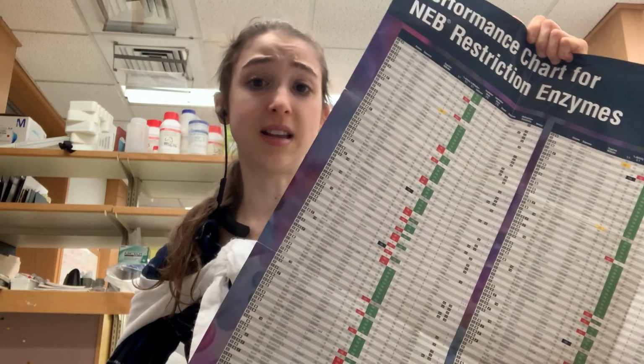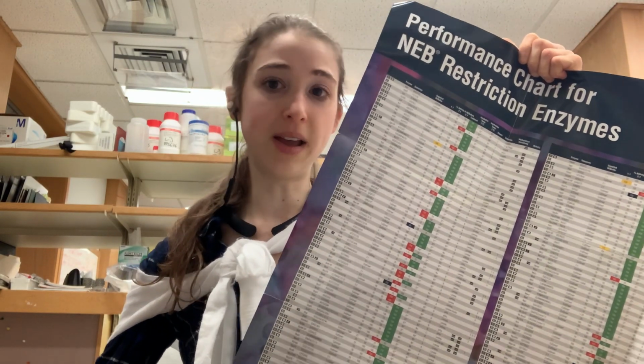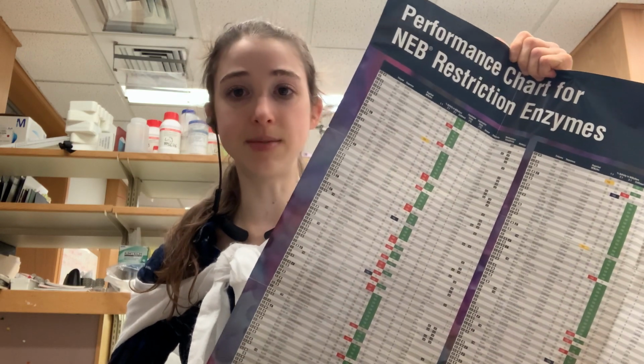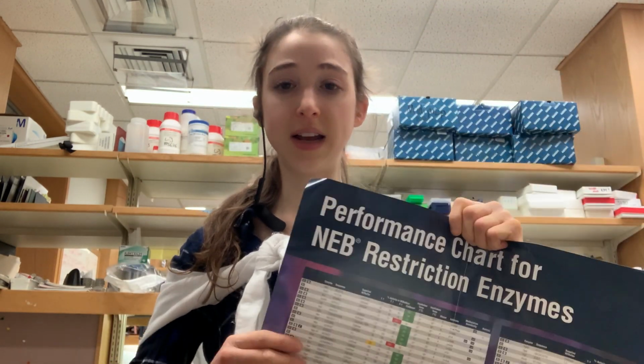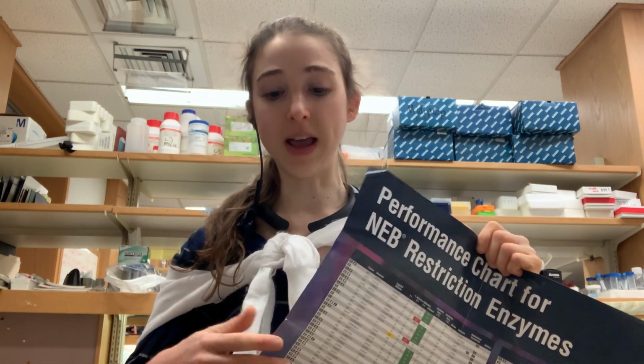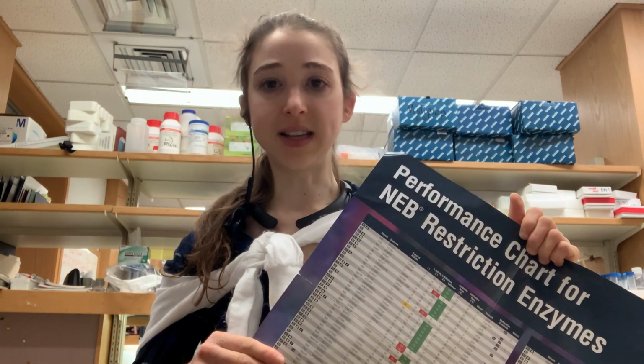I got this poster from a conference, and NEB has every restriction enzyme you could ever want, and they're the go-to place for restriction enzymes. I'll also show you on their website and a couple of other sites where you can design what enzymes you want to use, introduce sites if you need to, like silent sites, as well as some technical notes about using them.